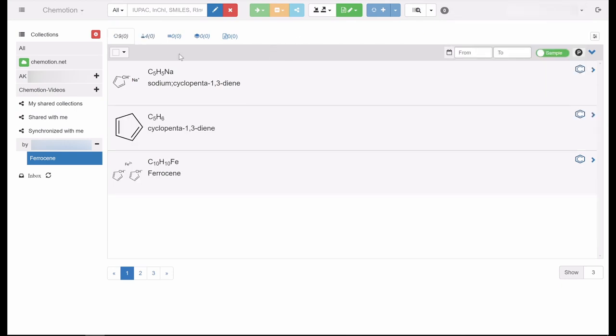The middle pane of the page displays the content and different items contained in the current collection.